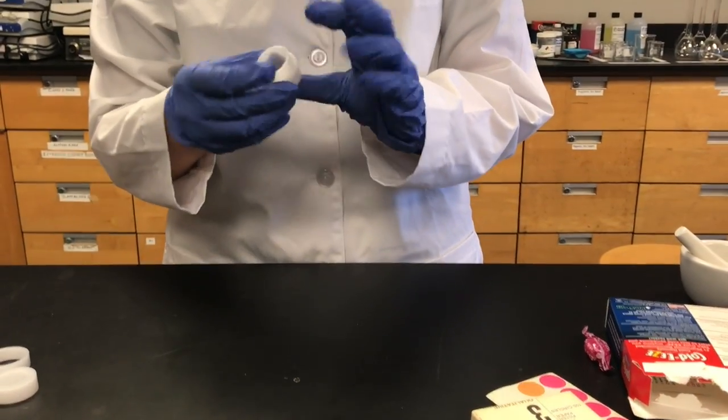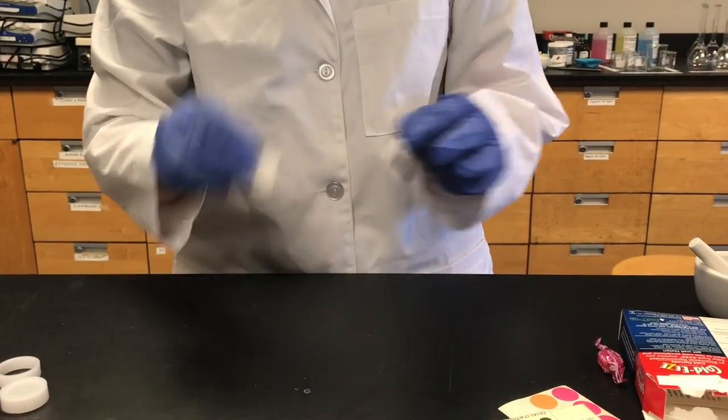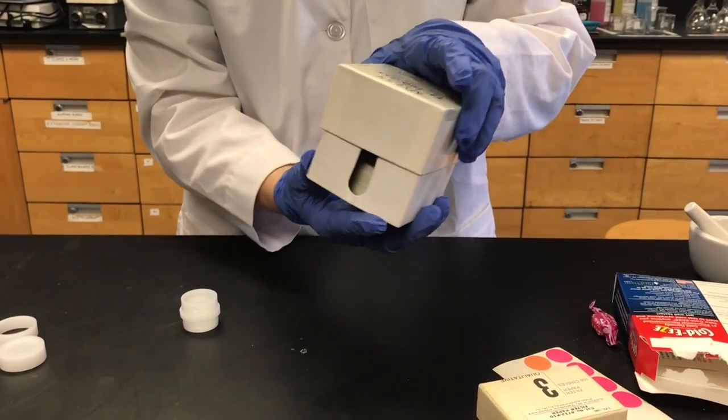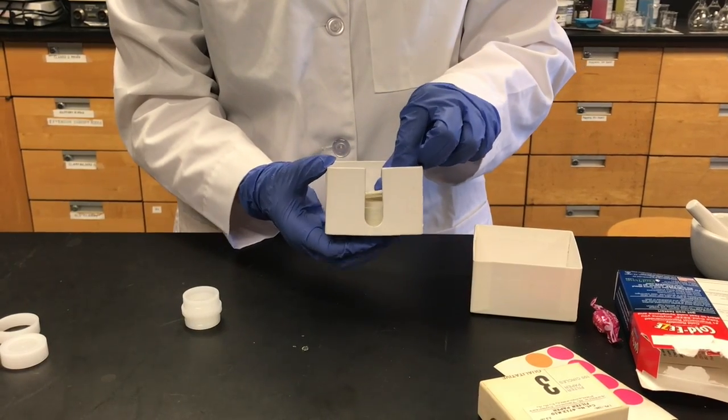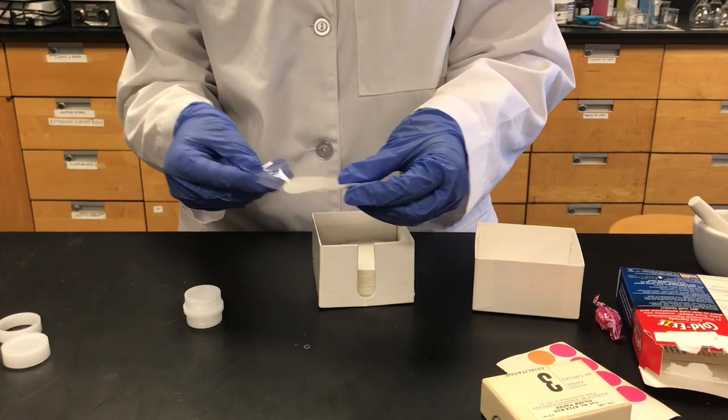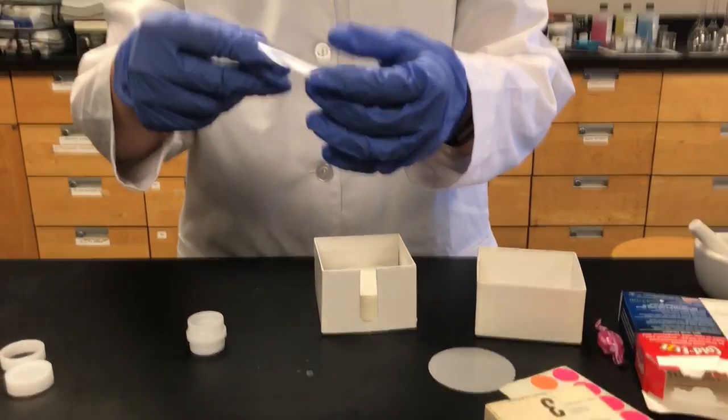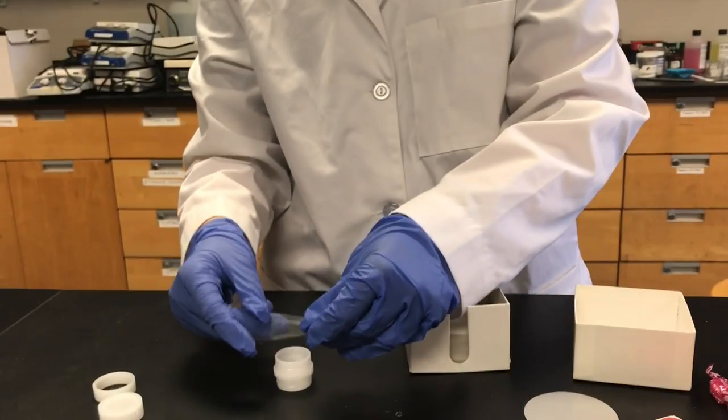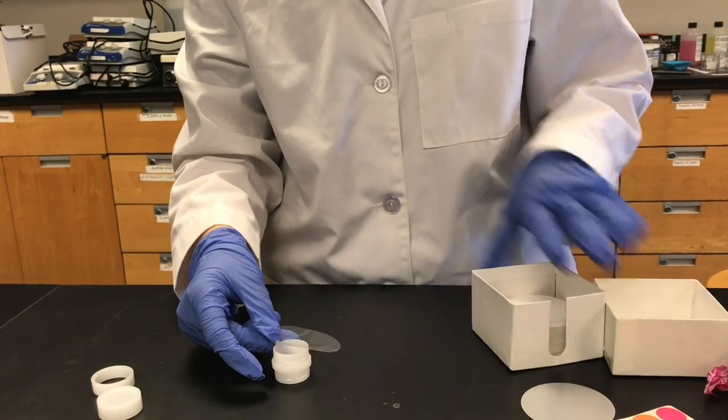You're going to take some of these mylar XRF films. You just need one and they'll peel right off of this sheet. So this is the clear sheet that you need. You're just going to gently place it on top of the body piece.